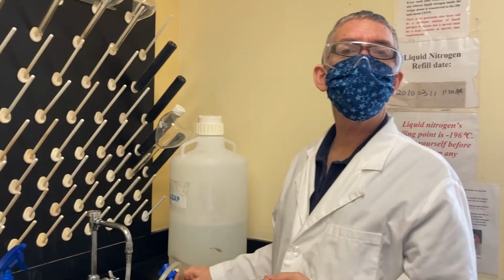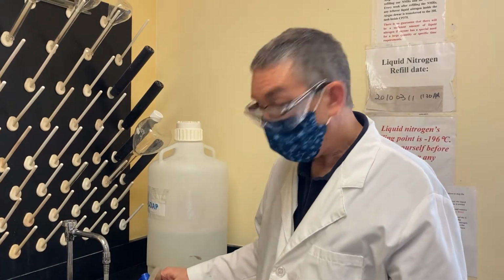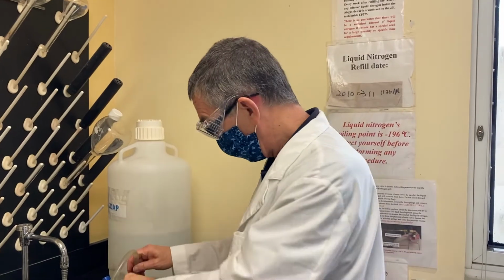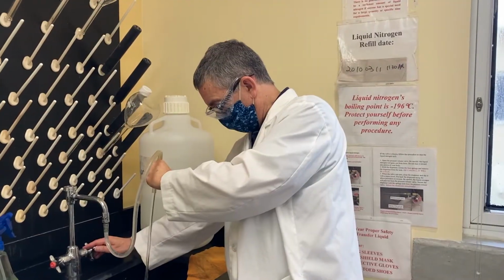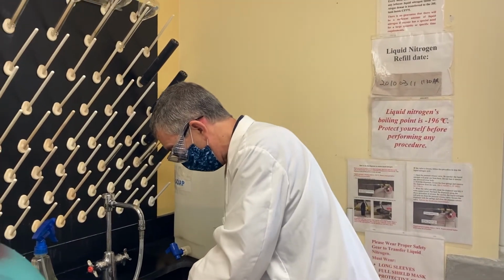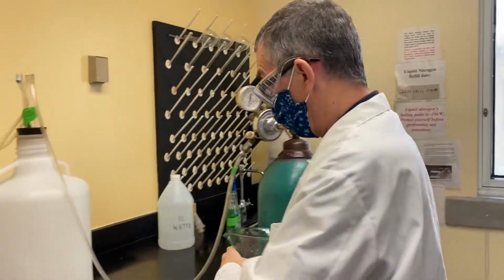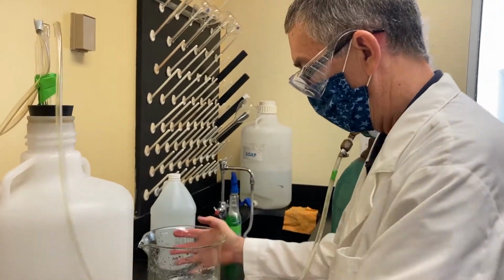Now the temperature of this water is not critical. Unlike in bomb calorimetry, when you really want it at room temperature, here it really doesn't matter. The amount of water is also not critical, just enough so that you can watch gas bubble.